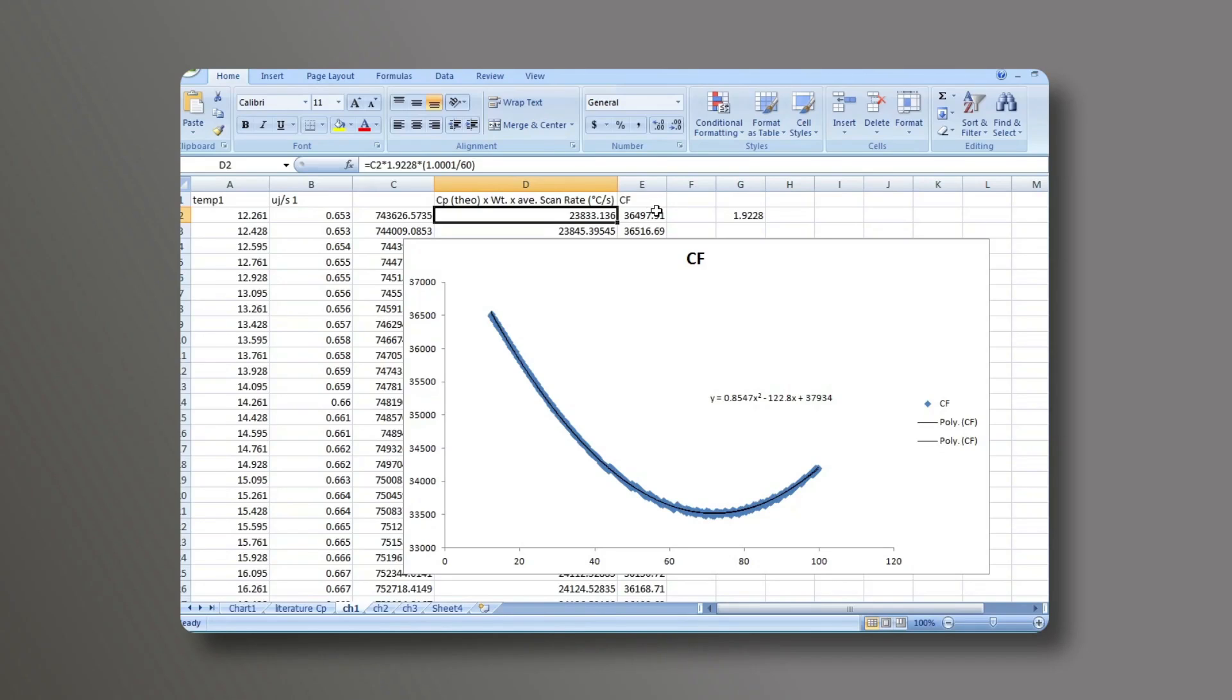Finally, what's plotted is column A, the temperature, versus column E, that calibration factor. This data is plotted and then fit to a second order polynomial.